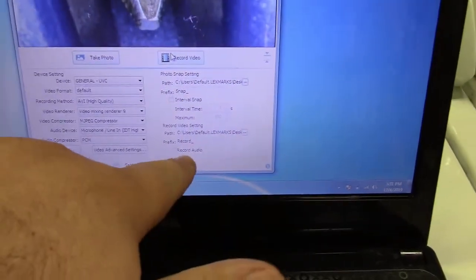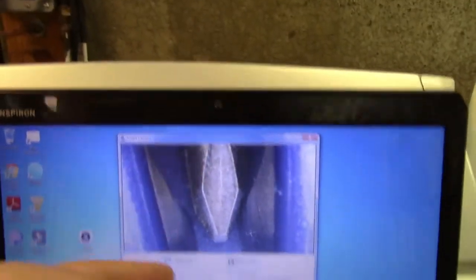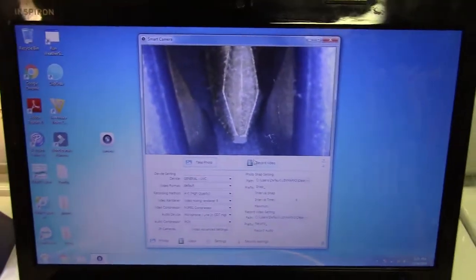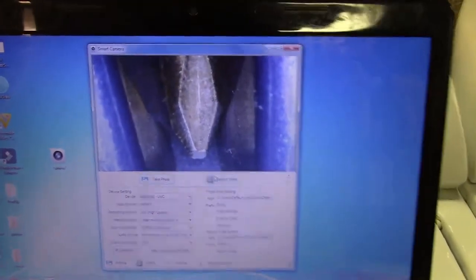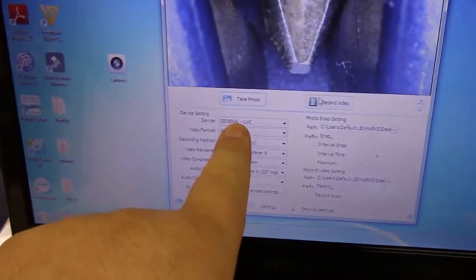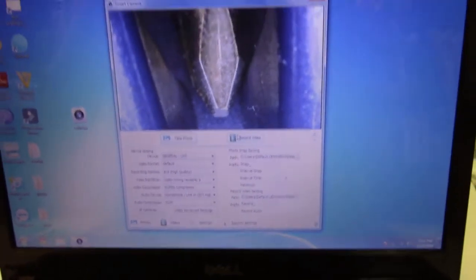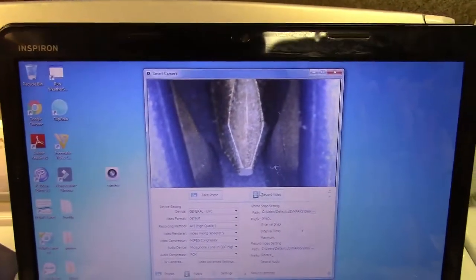It says it'll use an audio device already on your computer. Like, for example, this has a webcam. This allegedly can record right from that, because when I loaded the software up, it actually showed me, because there's a webcam right there. And right under settings here, I selected the microscope right there. So I'm going to go ahead and record a few things with this, and I'll voice over that, and then we'll wrap this up.